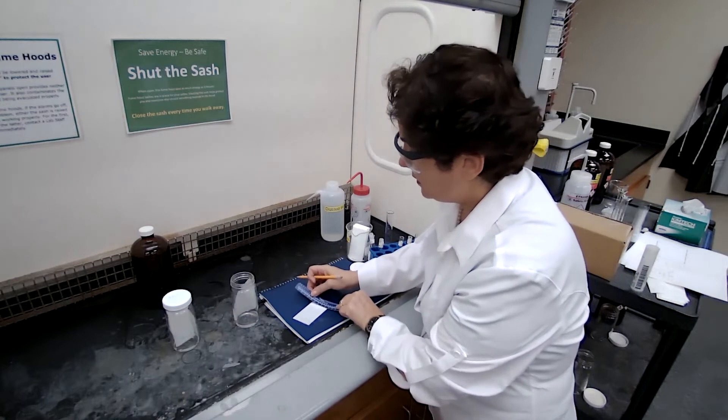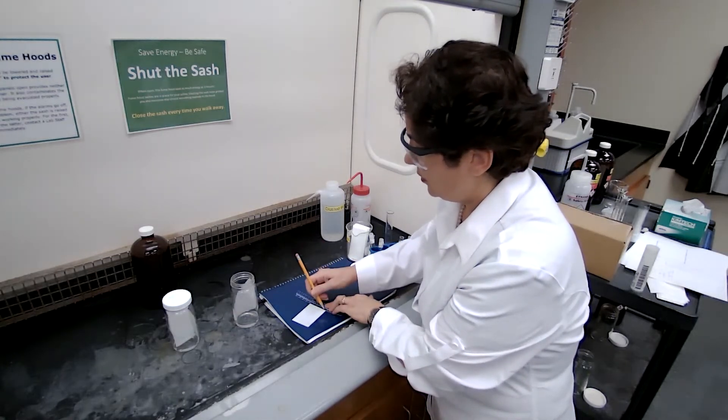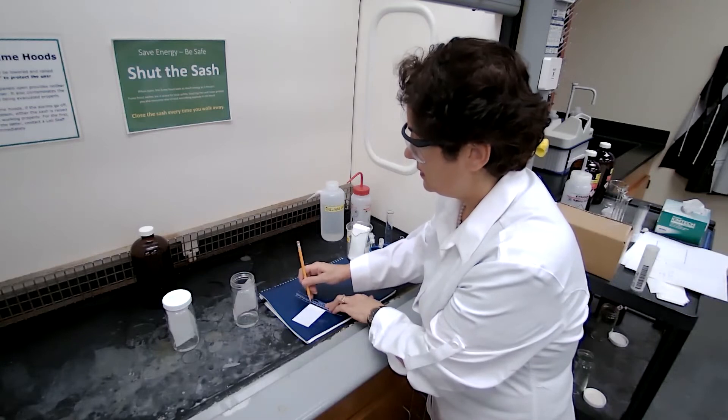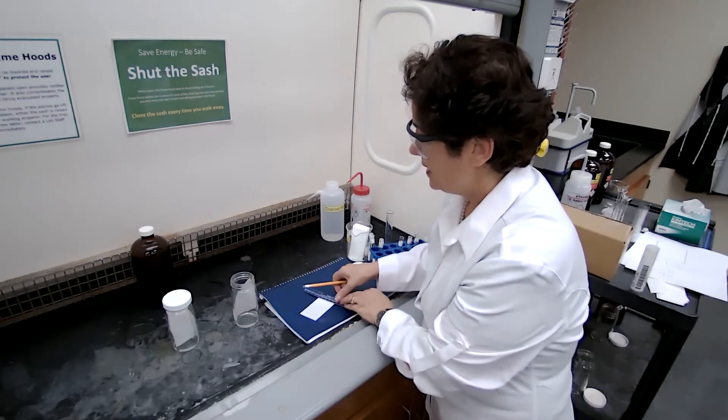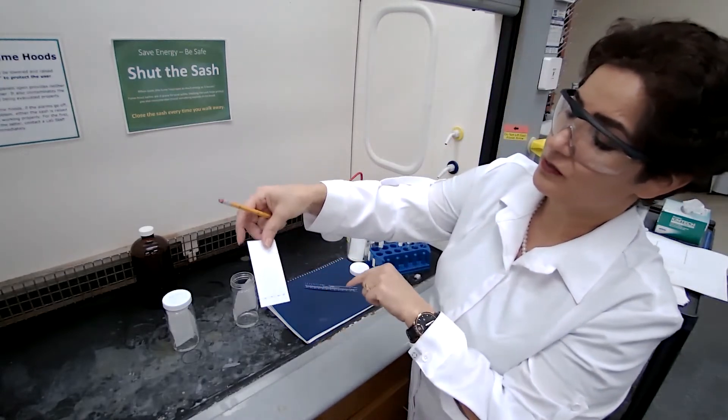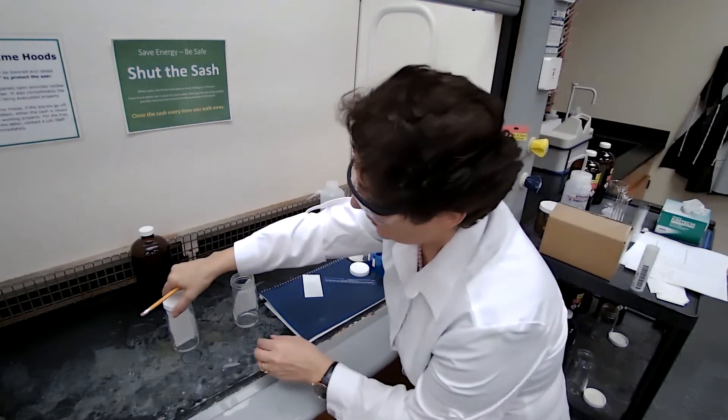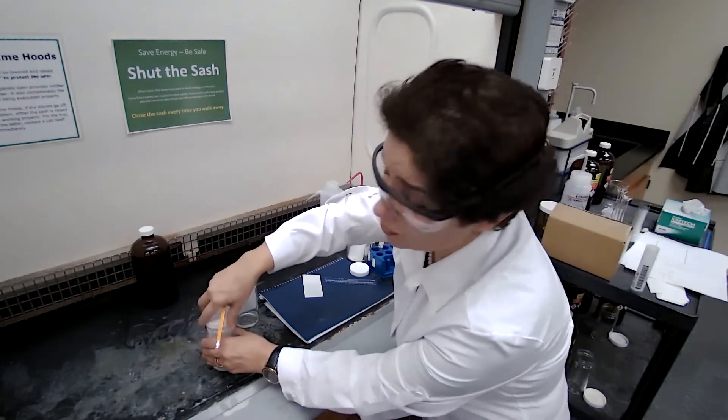So carefully we are going to just use a ruler and draw a line where the solvent travels, because as soon as it dries up, you see that line disappears from the wet plate to the dry plate.